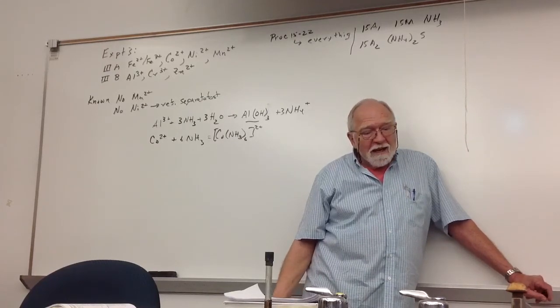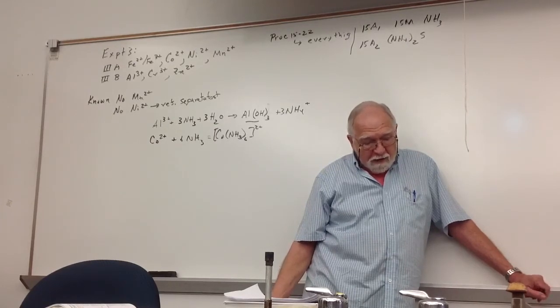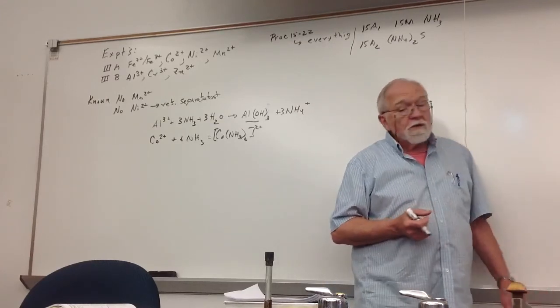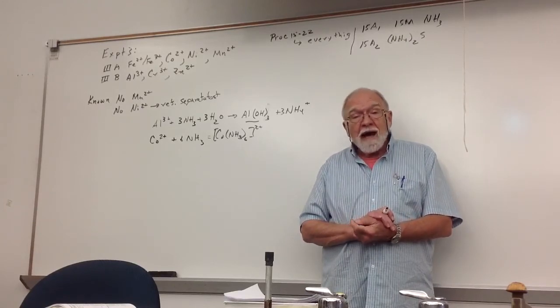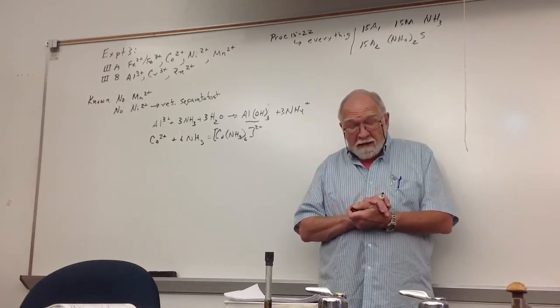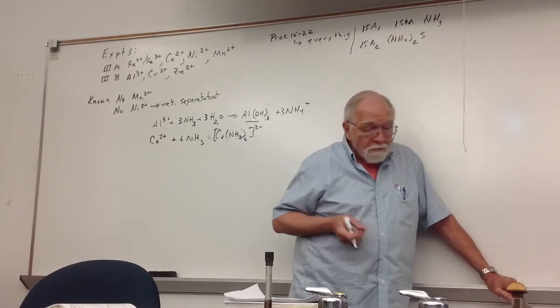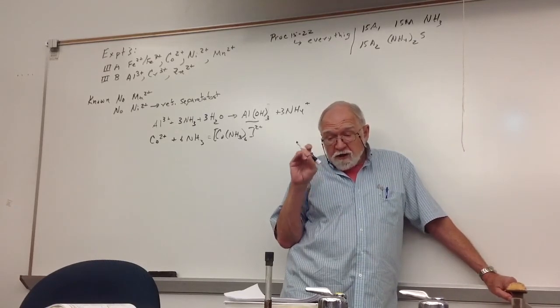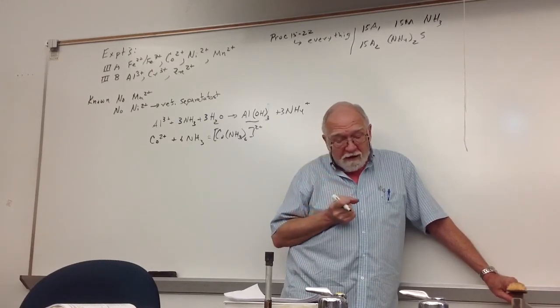That's because cobalt sulfide isn't as bad as the nickel sulfide, but when you're doing your unknown, you might potentially have nickel. The precipitates are forming colloidal particles, and they do not centrifuge out. So what you do is try to break down the colloid by adding things like ammonium acetate. That's the reason the ammonium acetate is 4 molar. I keep saying it's 4 times better, but it's also for this particular procedure because the more concentrated solutions discharge the charges on the surface of the precipitate particles, and they're more likely to coagulate.